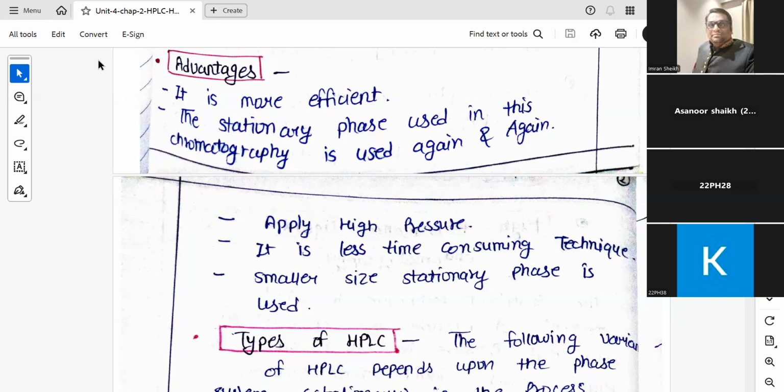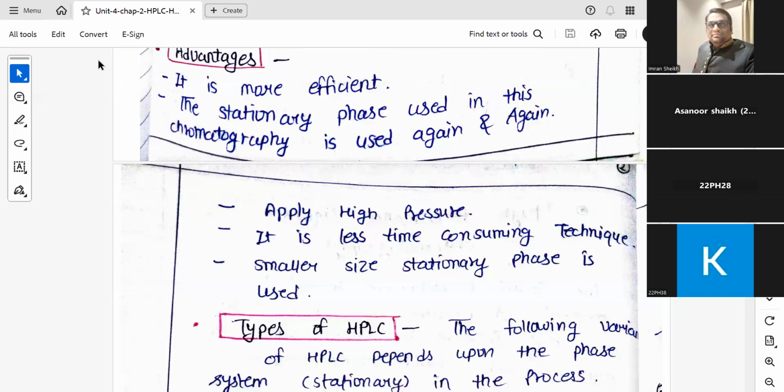Whenever there is a live instrument, I am of the opinion that purging should be done compulsorily after every step. That note should be pasted there so that the researcher or chemical analyst performing work on the HPLC has very little chance of missing it.